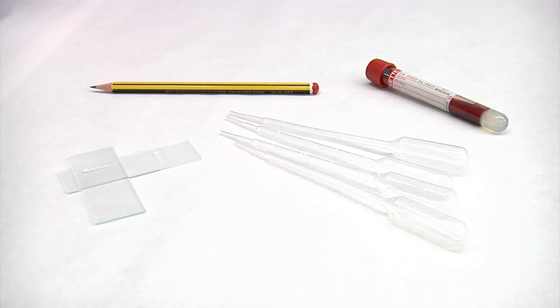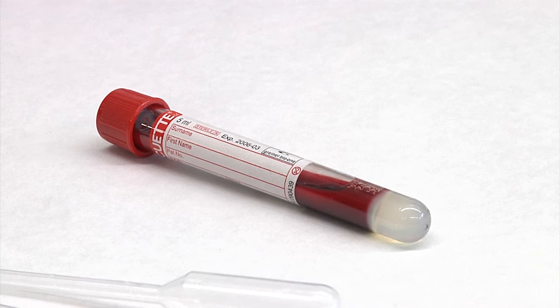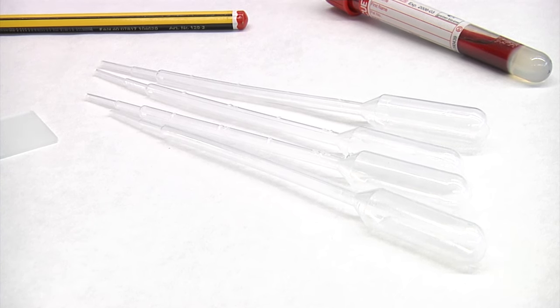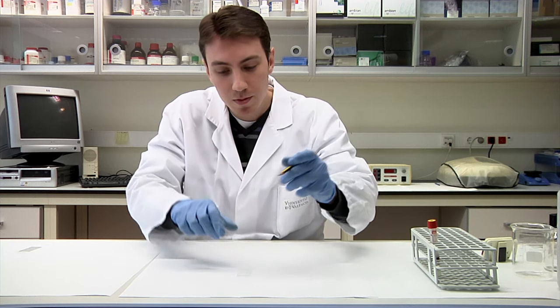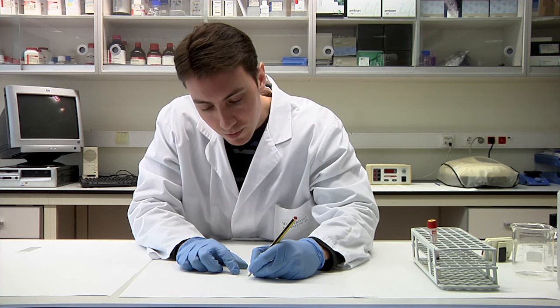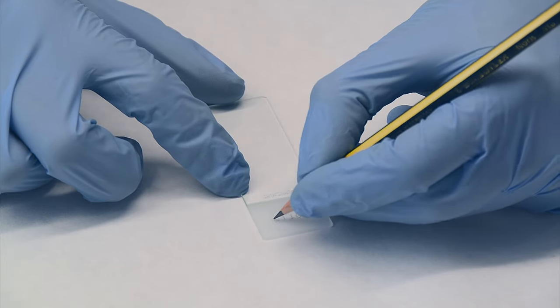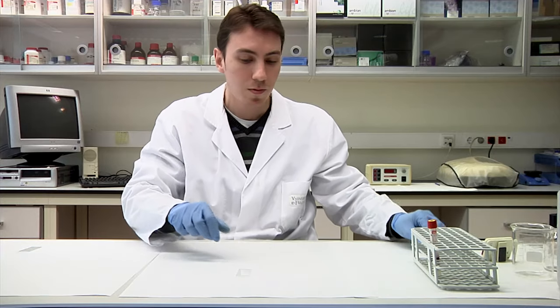The materials that we are going to use to make a blood smear are a blood sample, two slides, and a Pasteur pipette. We place a clean glass slide on a flat surface, for example on the laboratory bench, and first of all we label the frosted area with a pencil.